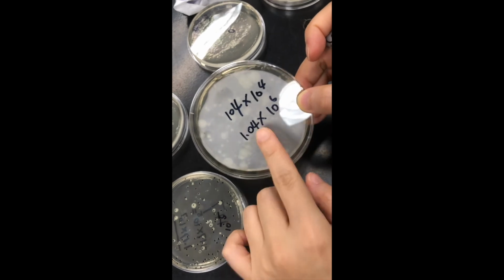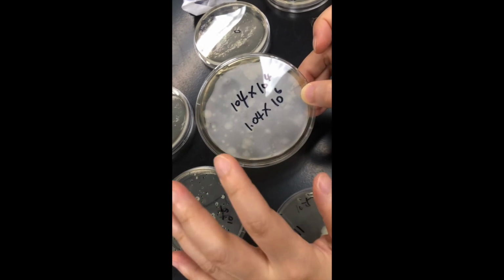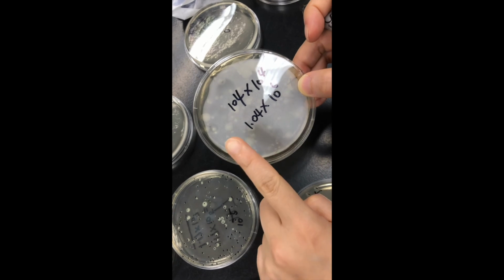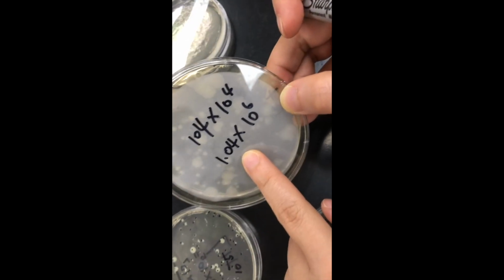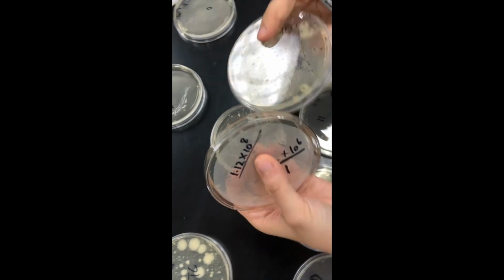This is the only number we are capable of using for our pasteurized raw milk samples. So please go ahead, input this number into your table and compare it with our unpasteurized raw milk sample. For the average CFU per ml, since for this batch we only have one number to use, this is the only number you are capable of using for your pasteurized raw milk. And for the unpasteurized raw milk sample, this is the only number you are able to use. So please compare these two numbers.